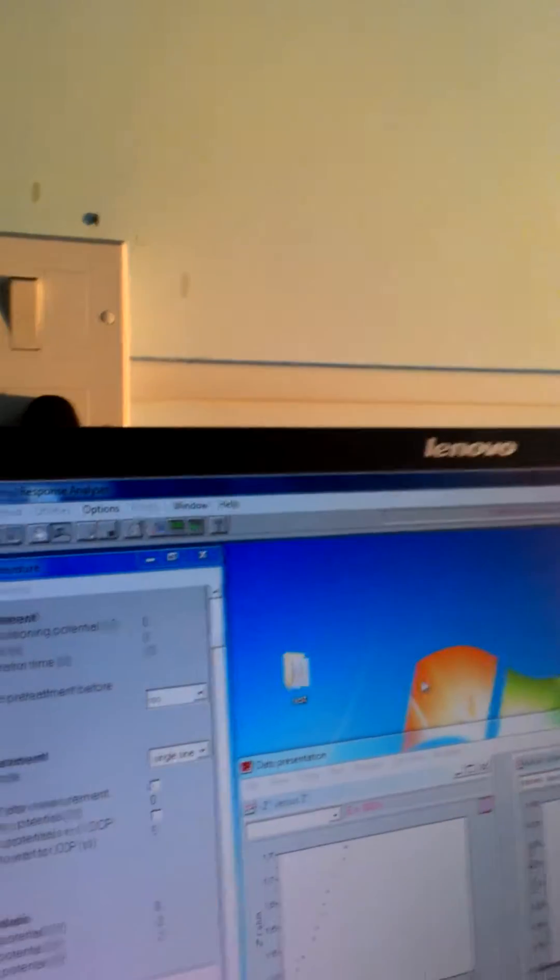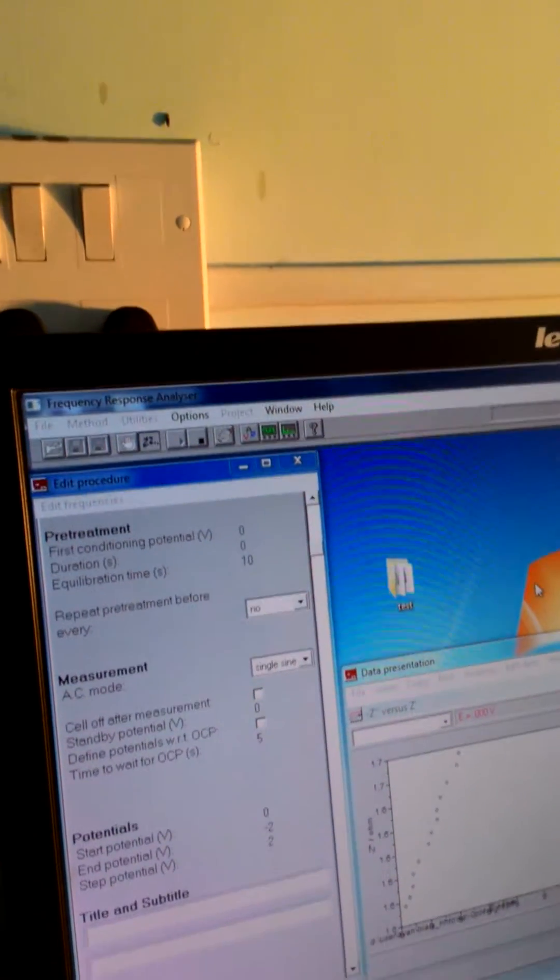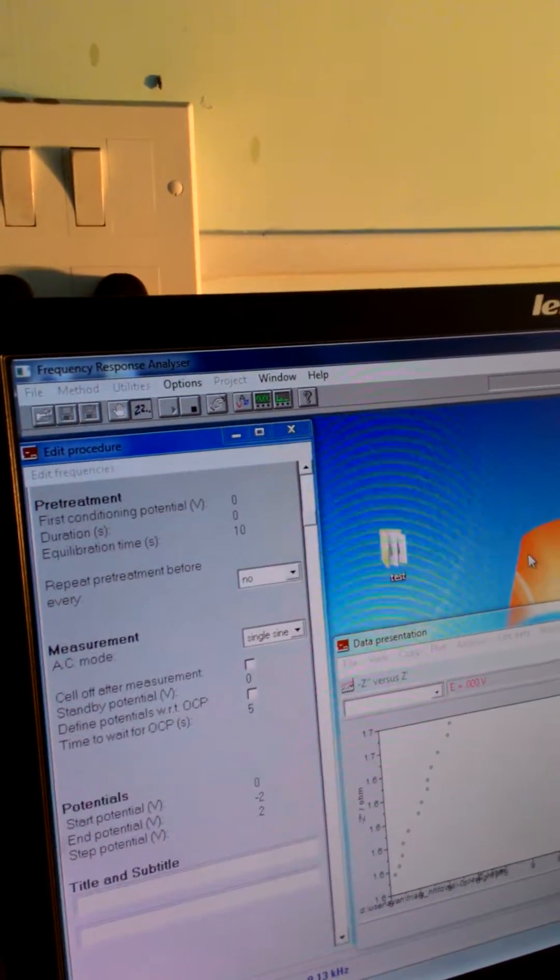First save it. And then after that, again, when you will go to file, there is option save as ASCII, click on that.